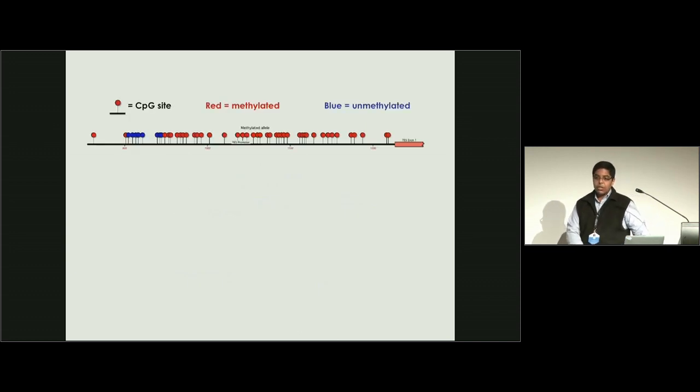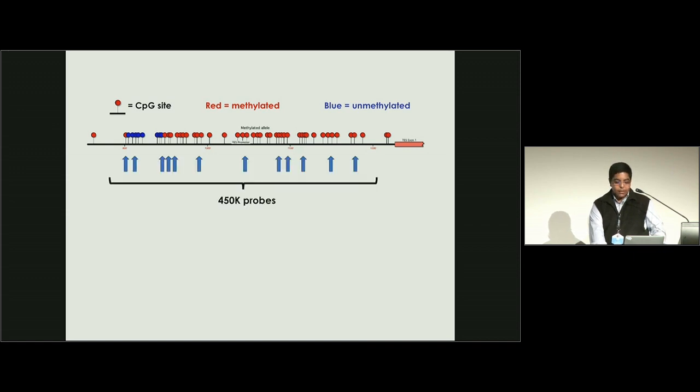There are a number of methods that were used to measure DNA methylation on the human genome, and one of these methods is the use of the 450K array system. The 450K array is an array-based system that contains more than 450,000 probes, and each probe interrogates a CpG site. There are a number of analysis tools available for the analysis of 450K array data. Unfortunately, the majority of these tools focus on identifying differentially methylated genes based on having one CpG site that's differentially methylated. For biologists like me, I find that it may lead to weak validation.